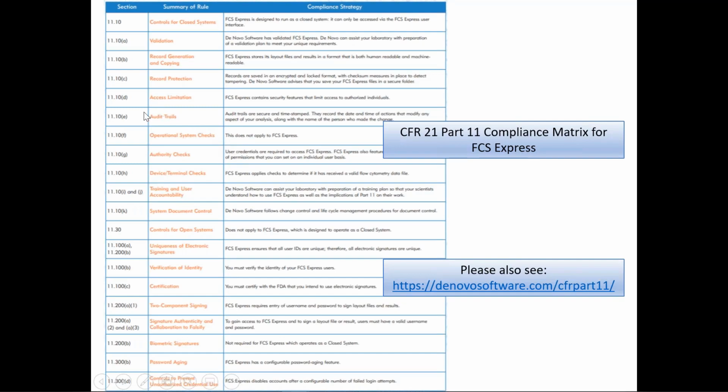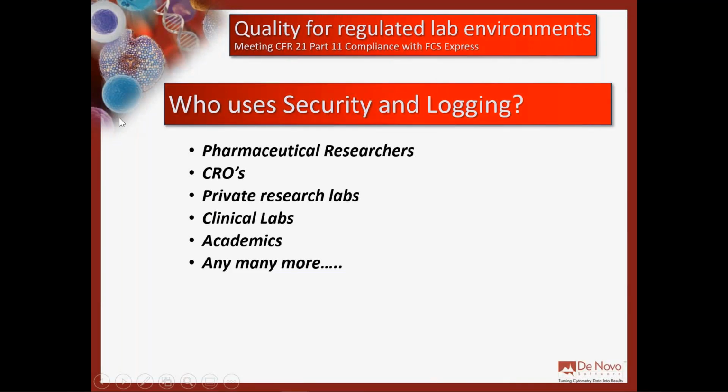And generally it comes up as well, who is using this currently, right? What labs out there, where is this useful in practice to be taking that beautiful data from the Miltenyi instruments and bringing it into FCS Express?